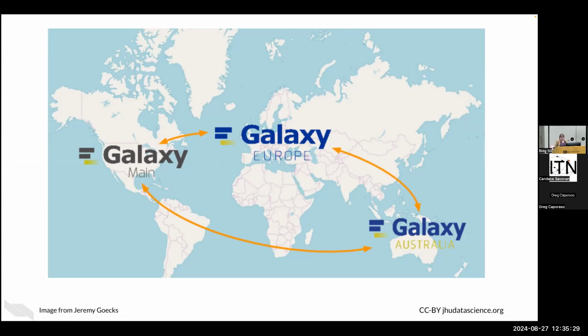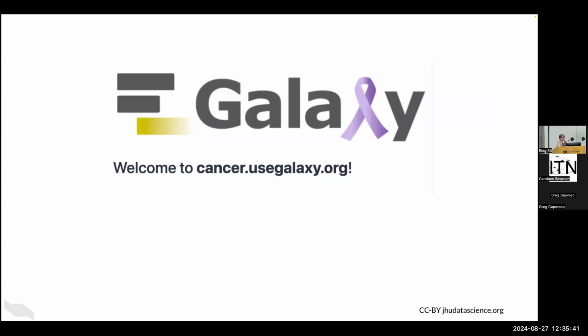I had to once because I wanted a mass spec tool that was only available on Galaxy Europe and it wasn't available on Galaxy Main. But this is an international effort where scientific communities from around the globe are working together on this.